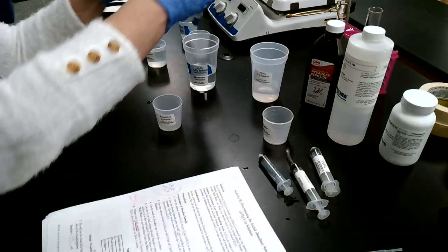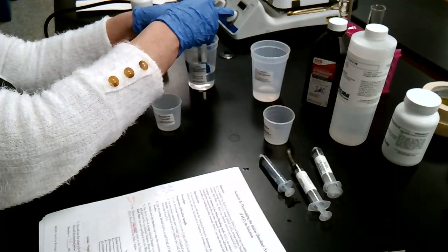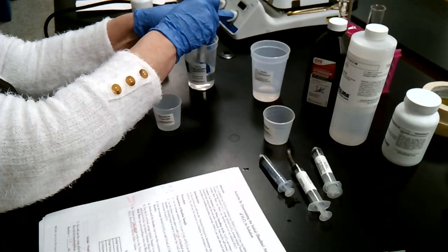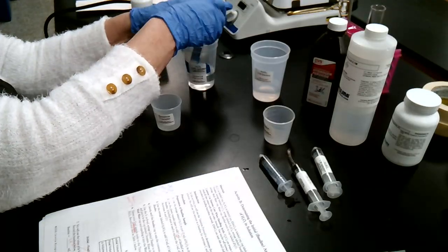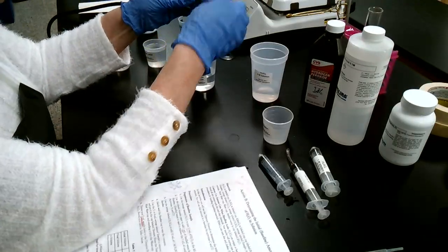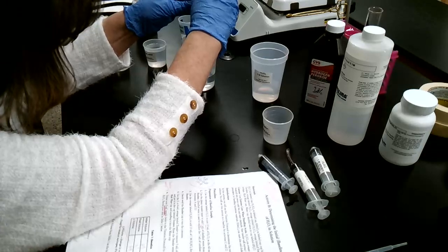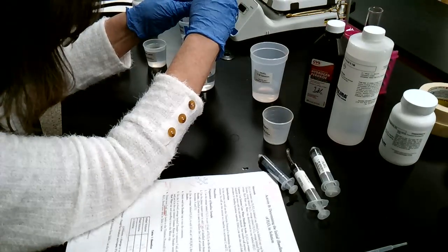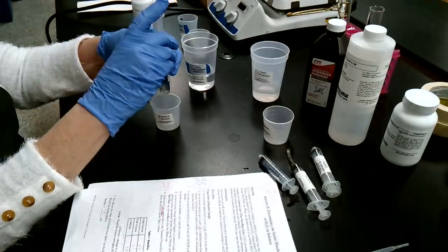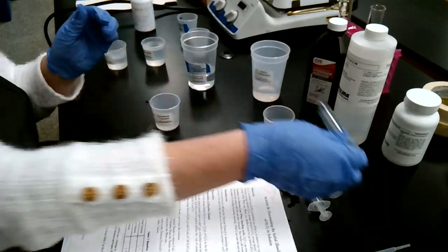So let's get started. Let's pull up a whole bunch of this hydrogen peroxide. So I stick it down into that hydrogen peroxide, and I'm going to pull up probably past the 10. Okay, I think I'm past the 10. Yeah, so I am. So now I've got to make sure I'm only putting 10 milliliters in here. So I'm going to squirt out until I get down to the 10 mark. Okay, and you'll see that with the syringe. So now I have 10 milliliters, and I'm going to squirt that hydrogen peroxide in there. That's the 10 milliliters, all measured out for me.